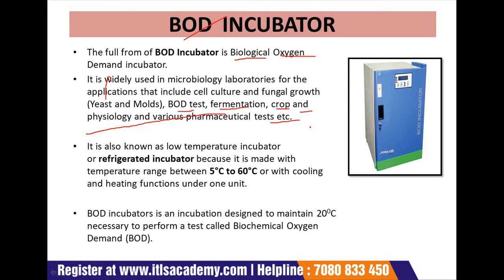It is also known as a low temperature incubator or refrigerator incubator because it is made with a temperature range of 5 to 60 degrees centigrade, with cooling and heating functions in one unit. BOD incubators are mainly used for lower temperature incubation purposes. A BOD incubator contains heating coils as well as a compressor for the cooling process.